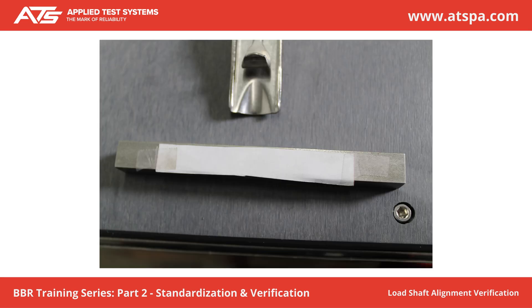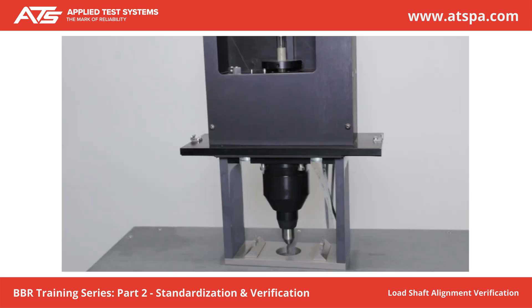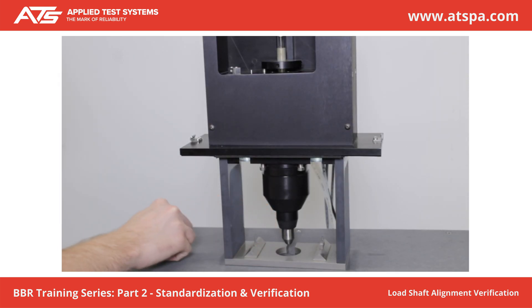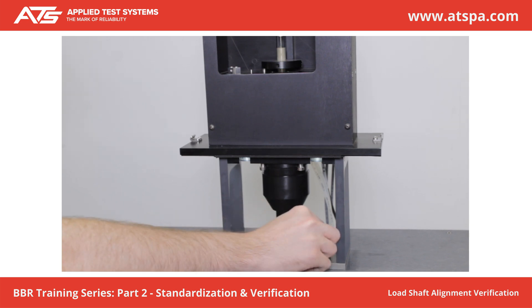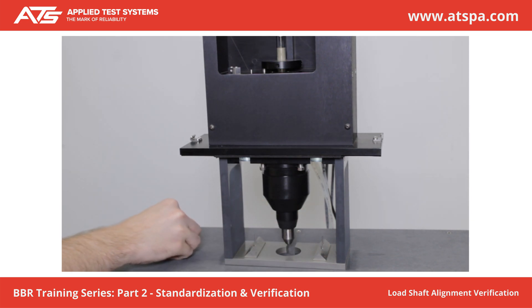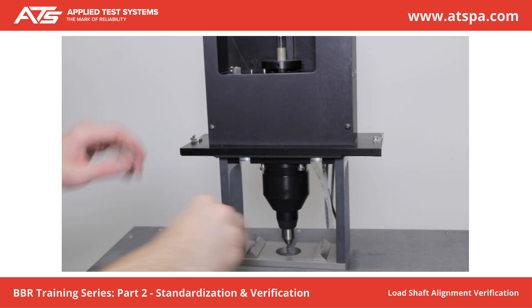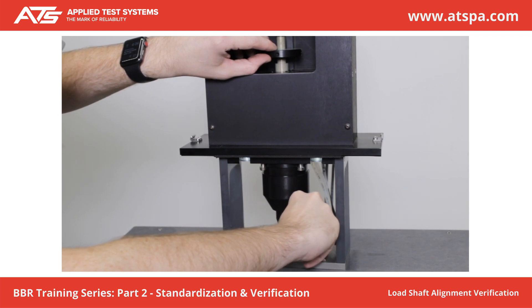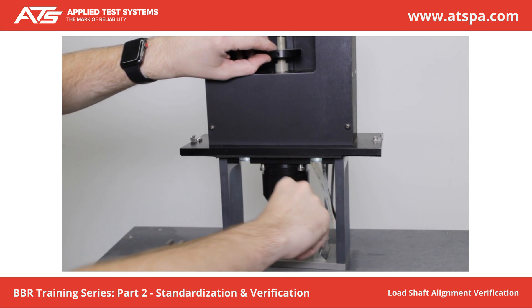Cut a strip of white paper about 25 mm in length and slightly narrower than the width of the confidence beam. Stick the paper to the center of the compliance beam. Remove the load frame from the bath. Place the compliance beam on the sample supports. Place a piece of carbon paper over the white paper that is stuck on the compliance beam. Lower the loading shaft to make an imprint from the carbon paper onto the white paper.